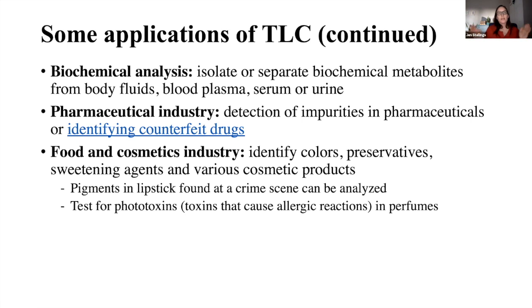So they took malaria drugs from a pharmacy, and then they went to street vendors who were selling malaria drugs that they put into different packaging. And they were testing to see if it was actually a malaria drug that they were getting from the street vendors. And they were able to use TLC to find out that I think maybe there was like Tylenol in it, something innocuous, nothing bad.